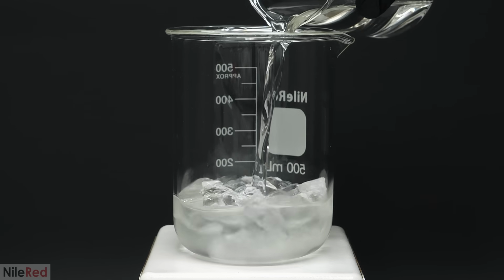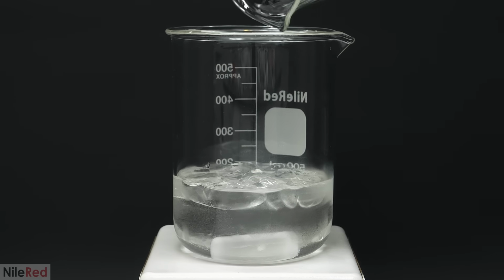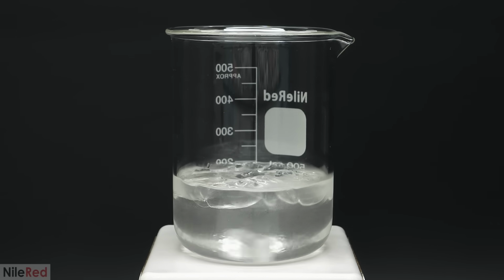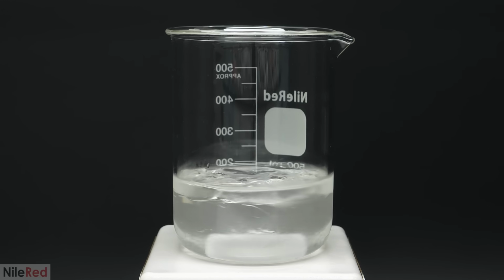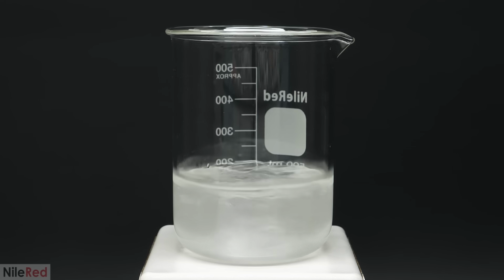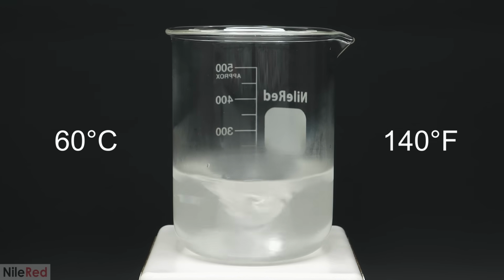This almost immediately caused most of the ice to melt, and when it was all added, I turned on the stirring. What I was doing here was just diluting the sulfuric acid and bringing the concentration down from 98% to 75. I also used ice to do this because it generated a lot of heat, and the whole solution was now probably around 60 C or 140 Fahrenheit.